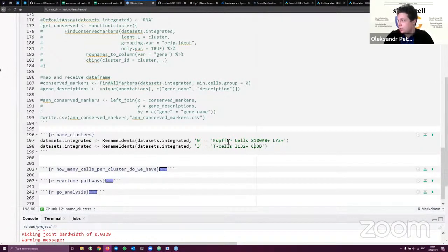You're looking at CD3 plus, CD3D plus. It will already help to distinguish the cells today. However, in the real world, you would like to define the cells a little bit more specifically. So we have a question: how can we choose the right cell cluster? If we could ask something more specifically, that would be also very helpful.